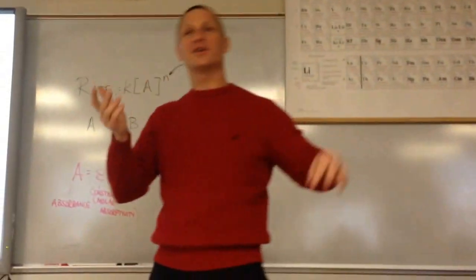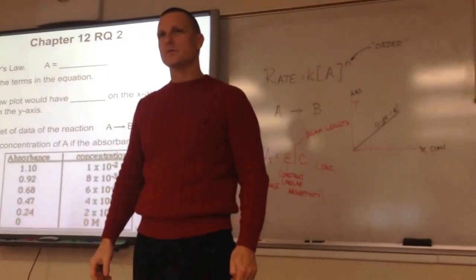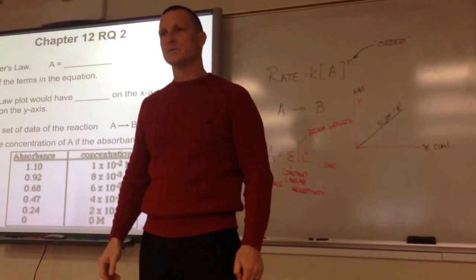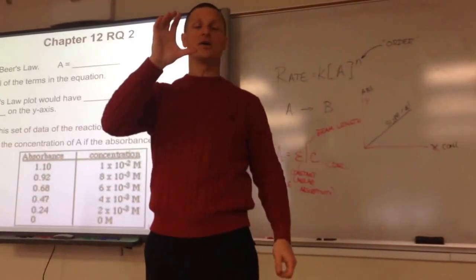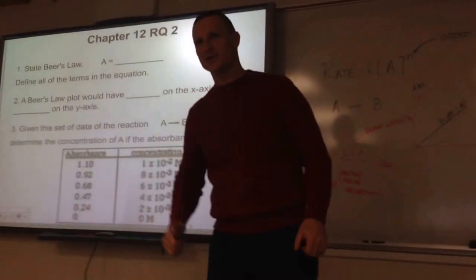All right, that's enough. Nice. You can sing while you're doing your experiment. I read that as it gets absorbed more, there's more color to show. Yes. So as the color goes away, the absorbance is going down. That's good. I should ask a question like that.